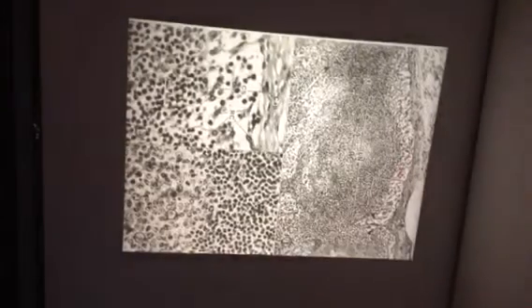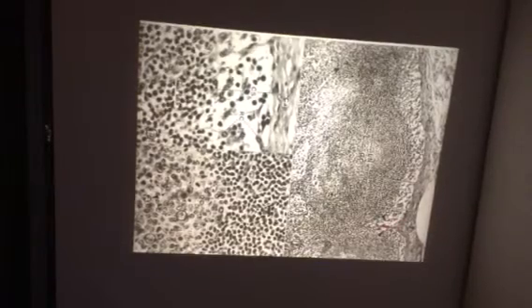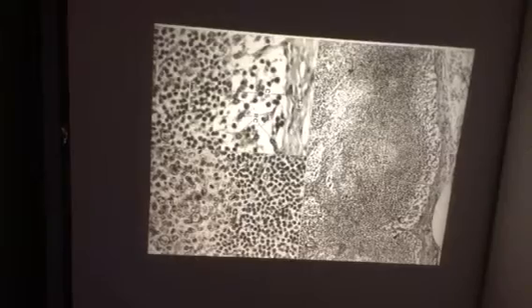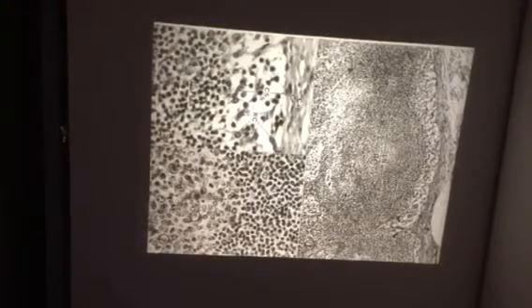Right underneath that we have what? Subcapsular sinus, and then we have a trabeculum coming down, and alongside that we would have the trabecular sinus. There's a germinal center, and this would be the lymphatic nodule. And in that subcapsular sinus, from time to time, we could find a reticular cell. Possible, but not probably going to be on the lab practical.